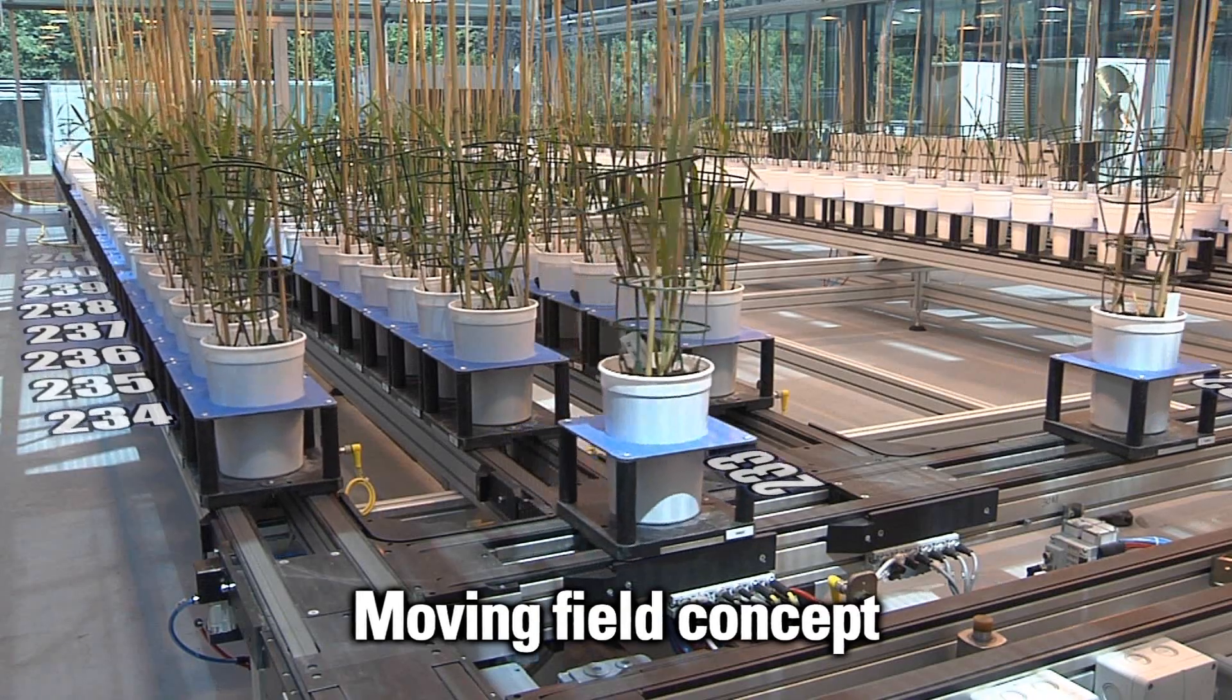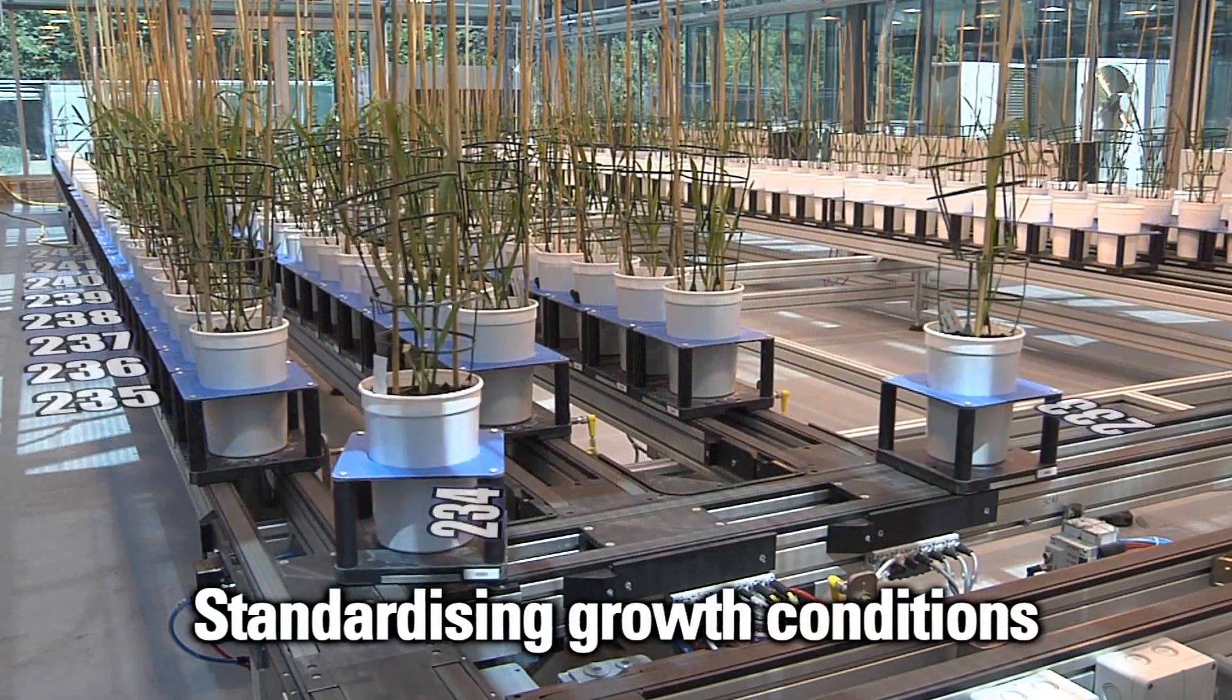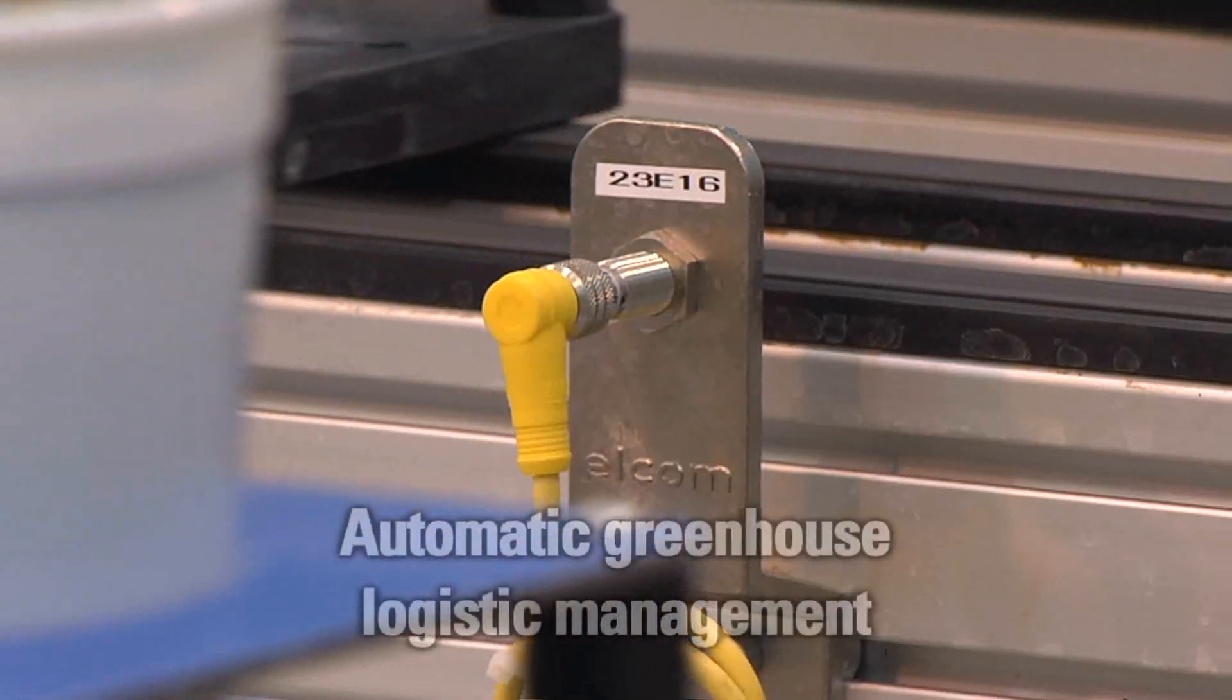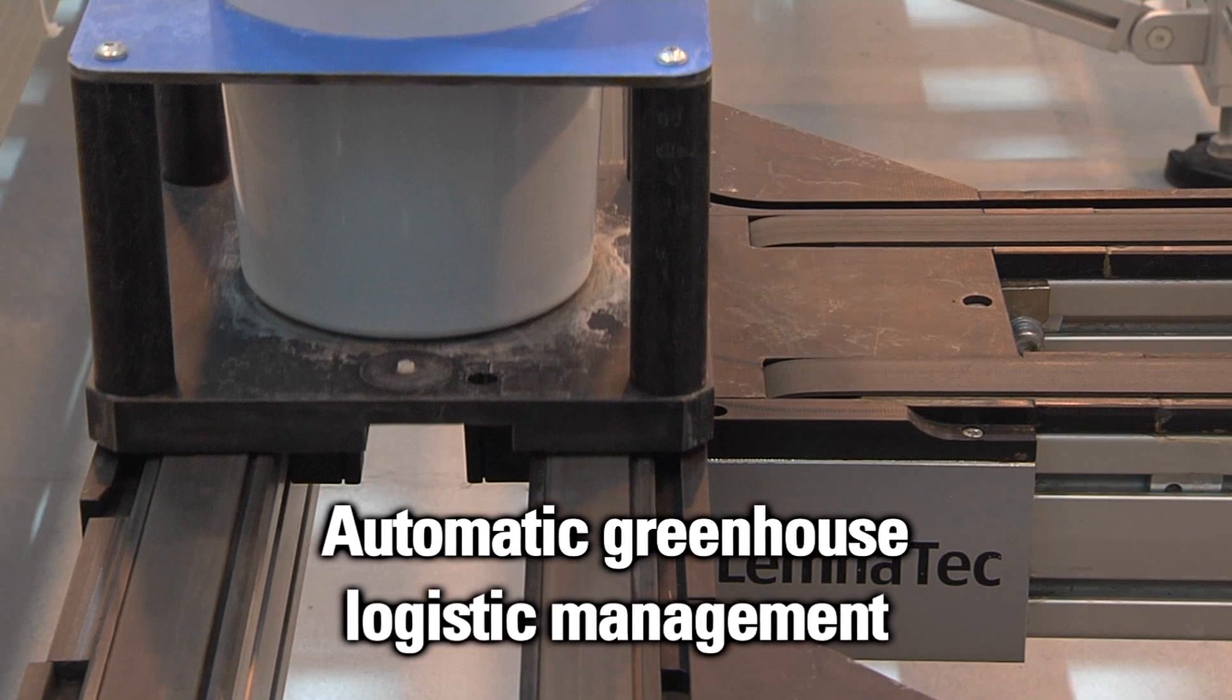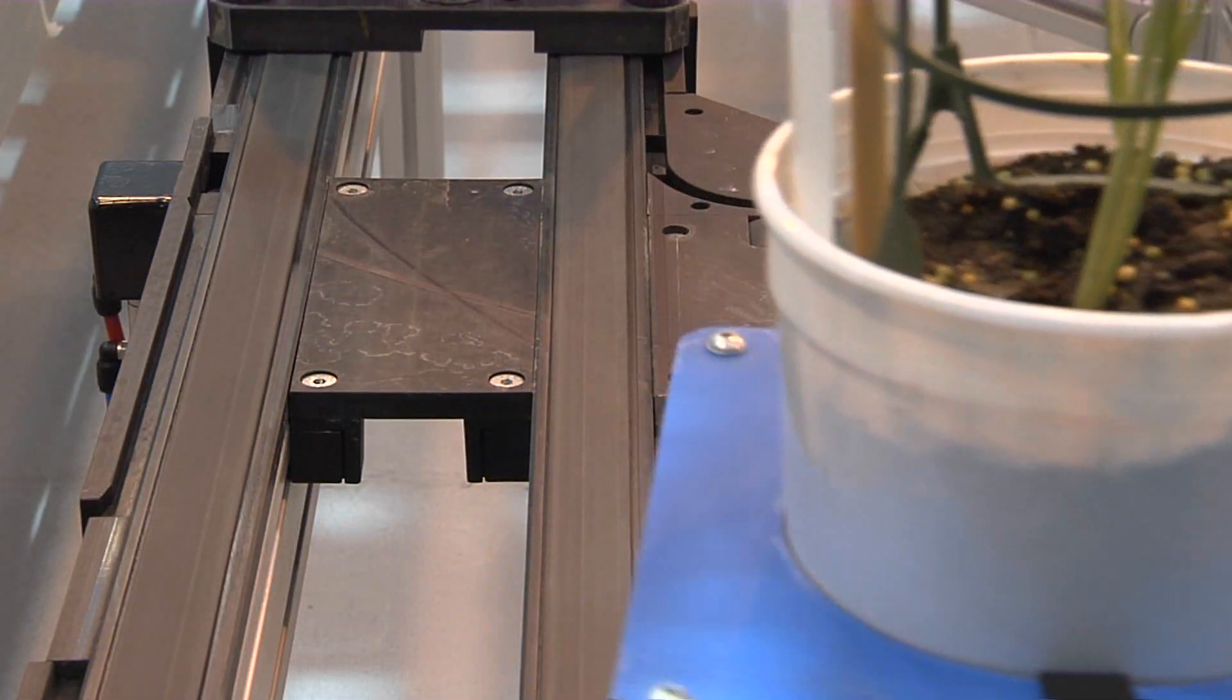Plants are phenotyped continuously with the so-called moving field concept, enhancing the statistical power of the greenhouse trials. Hotspots are eliminated and growth conditions are homogenized by continuously moving the plants through the whole greenhouse on predefined or random patterns.